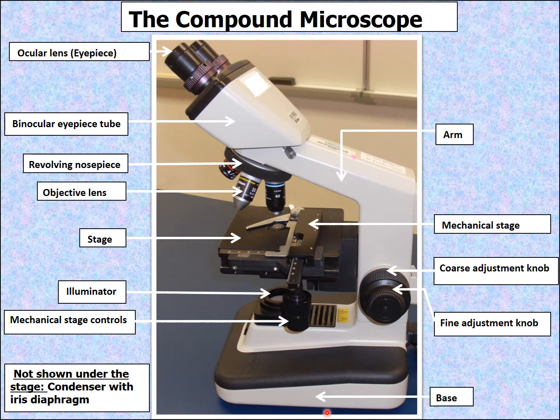This microscope here is relatively old, right? But they are still pretty expensive, and as you deal with newer microscopes, it gets more and more expensive. So it's important to care for those.